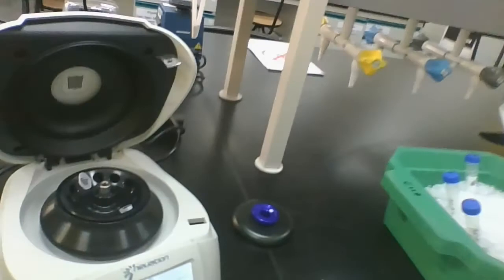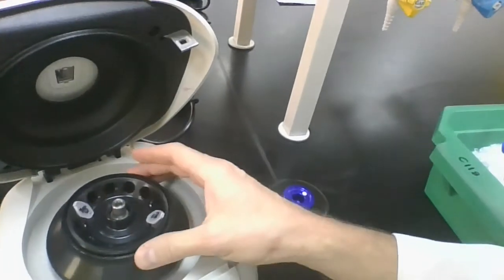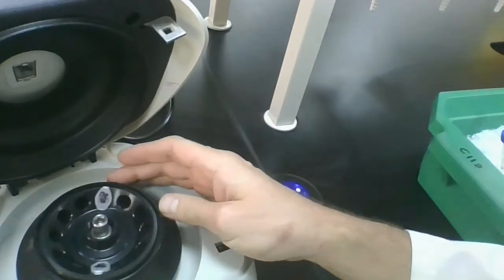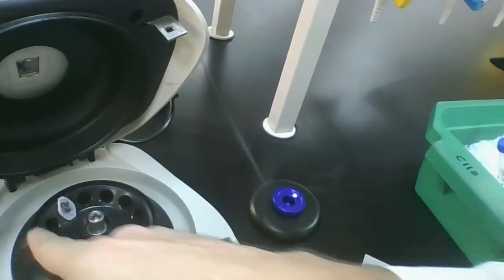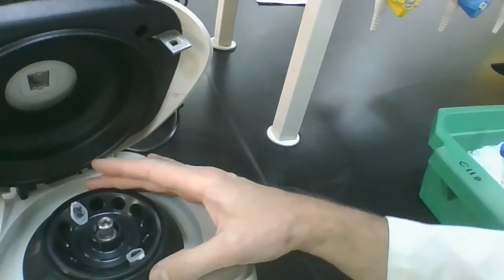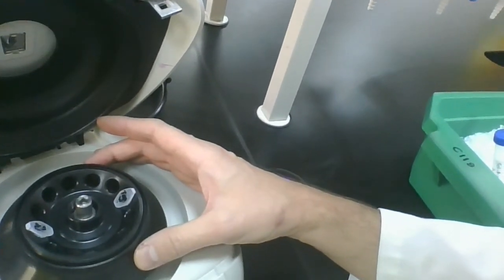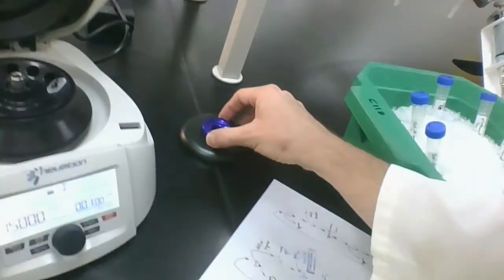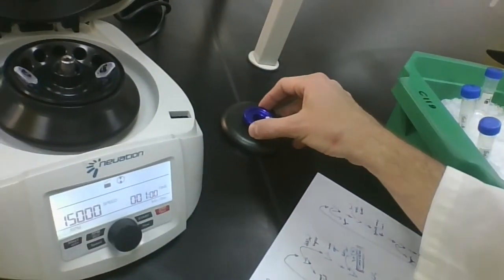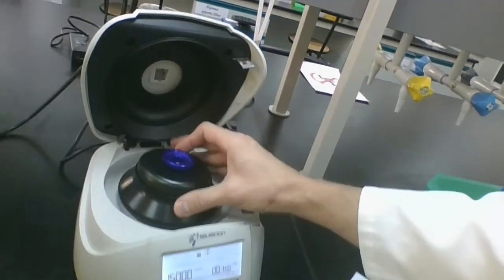I'm going to do this the hard way, I guess. I'm not going to do that fancy thing with this. You can see here we have our tubes set out in a rotor, and they are on opposite sides of each other. I have five empty spaces on this side and five empty spaces on this side. One of the reasons why I gave you an even number of tubes to work with is so that you can easily balance your tubes before you get started. My centrifuge is currently set to the maximum speed, and it is set to 1 minute. That's what we're going to be spinning for. So I'm going to close it up, and we're going to get started with the procedure.